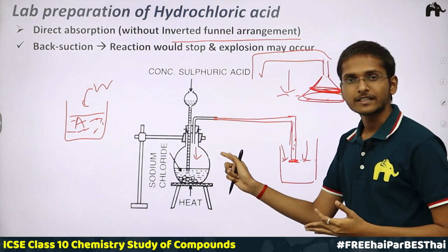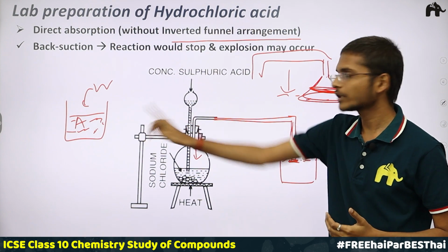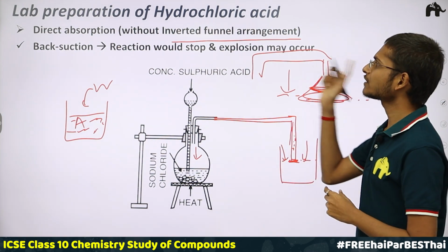Water is getting added into the acid. Okay, not acid is getting added into the water. A small amount of water is getting added into the acid. Okay, same thing. So here also there would be an explosion. So that's the reason we don't use this direct absorption method, or the arrangement without an inverted funnel.